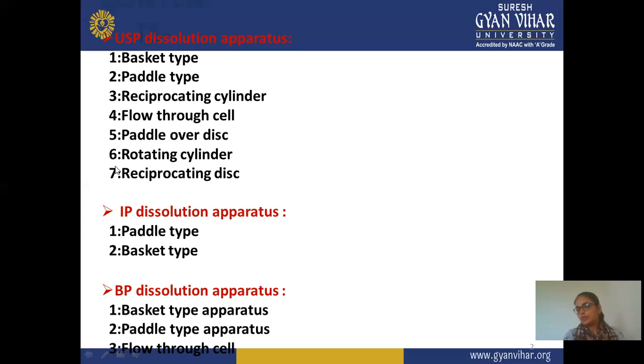You can select a particular apparatus for your formulation. This selection depends on the type of formulation you use for the dissolution study. So according to your formulation, you can select any one apparatus which is appropriate for your formulation.